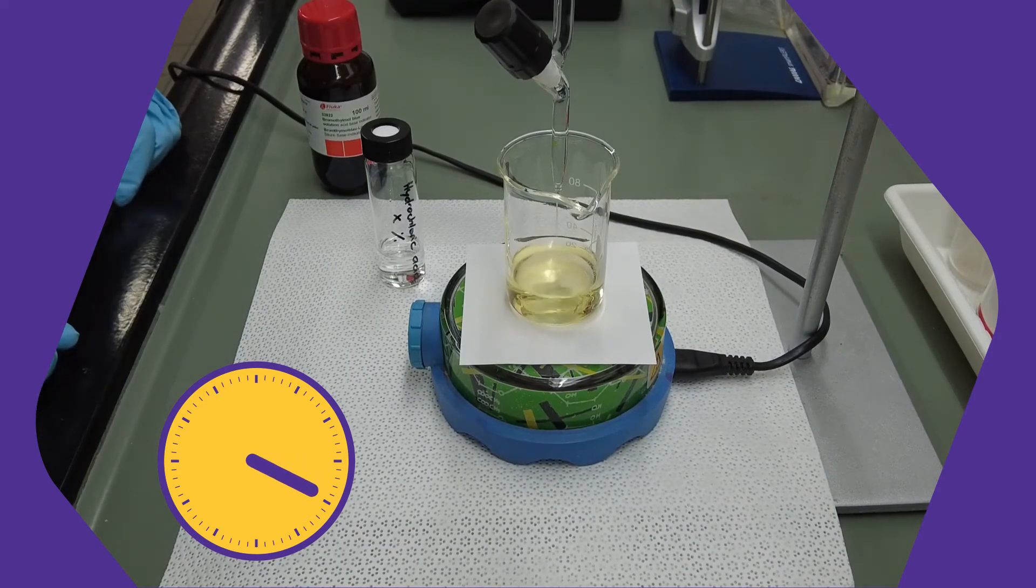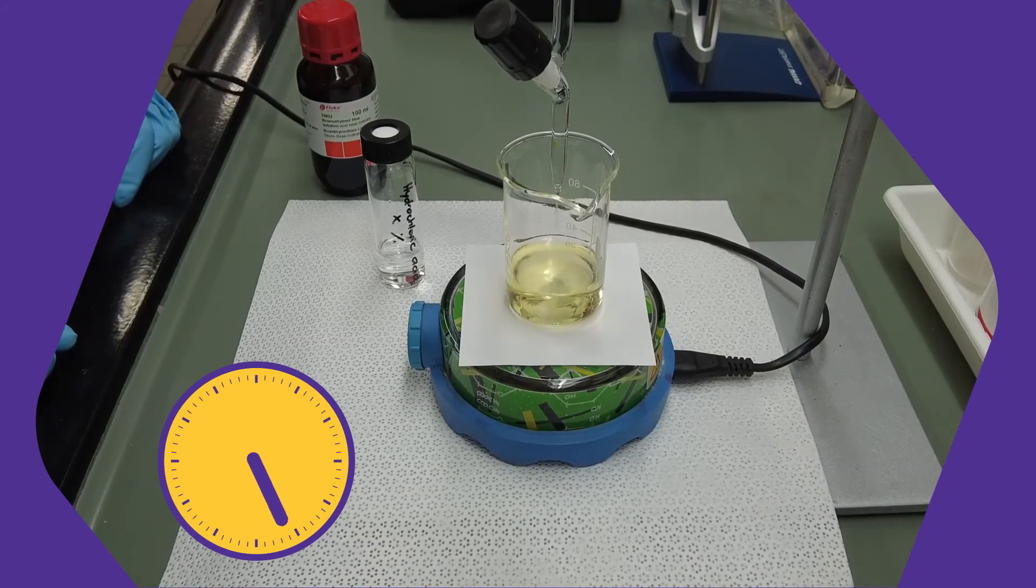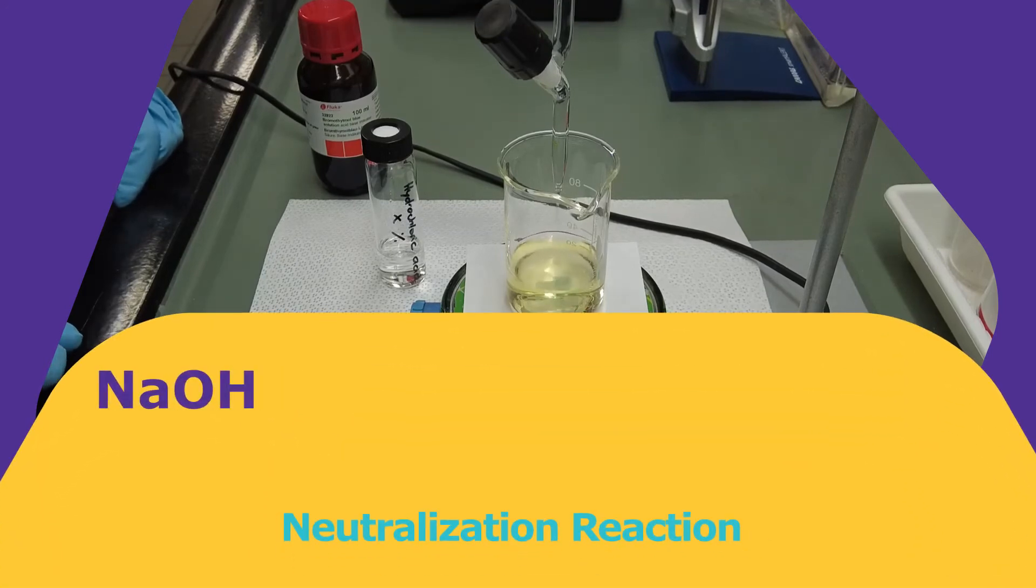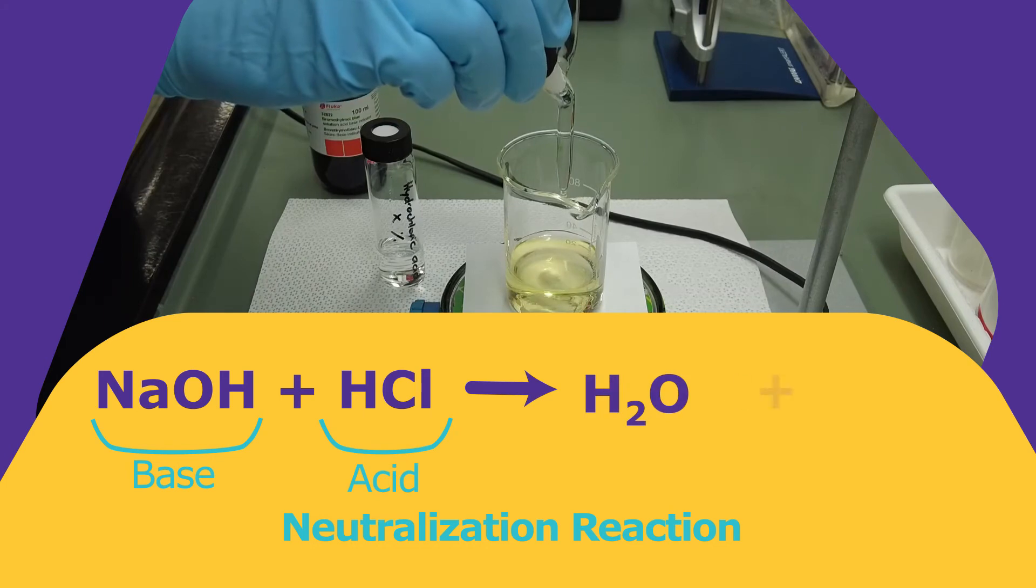A burette is a graduated glass tube with a tap at one end for delivering known volumes of a liquid, especially in titrations. In this process, the sodium hydroxide will react with the hydrochloric acid to form sodium chloride and water.